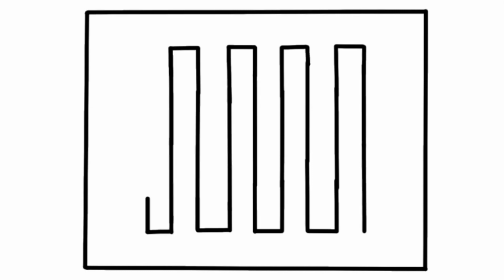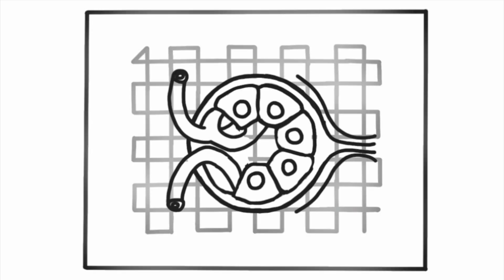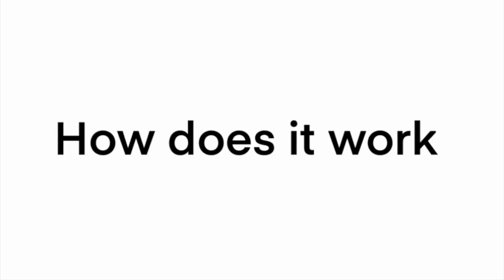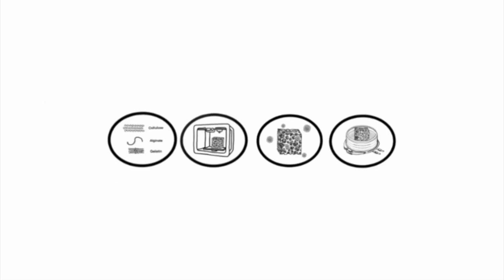3D bioprinting is a technology that is capable of distributing cells and biomaterials in a precise fashion that is capable of mimicking the internal environment of tissues in vitro, which could ultimately be used to create organs for transplantation in vivo. How does it work? Regardless of the desired tissue type, there are 4 main steps involved. Let's take a closer look at each step.